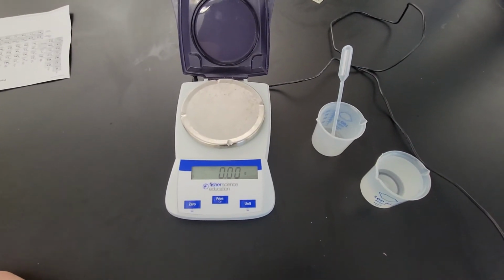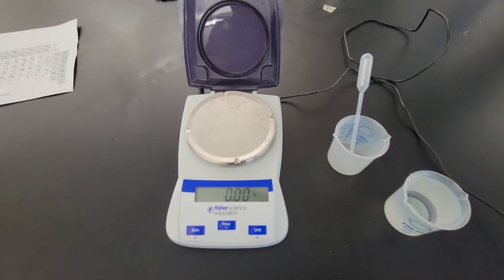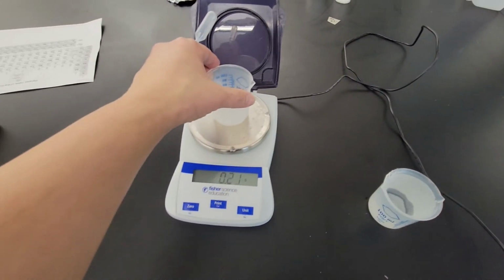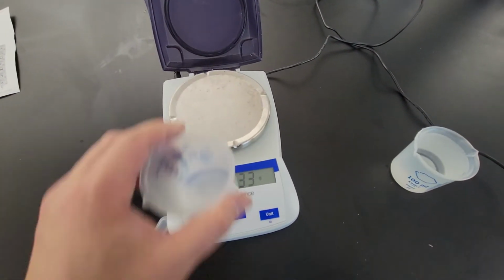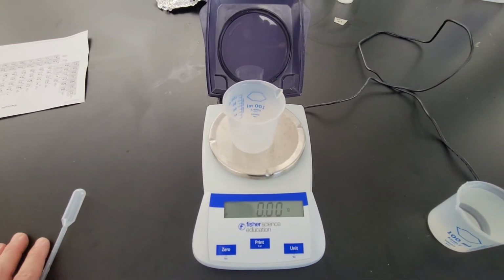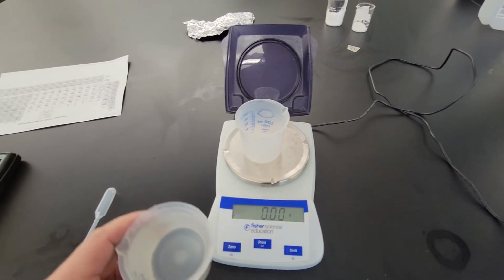So our final task is to count 1.57 times 10 to the 24th water molecules, and that equates to 46.97 grams of water. So I zeroed it out.